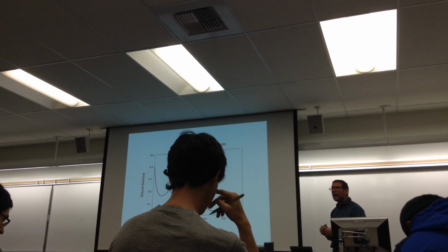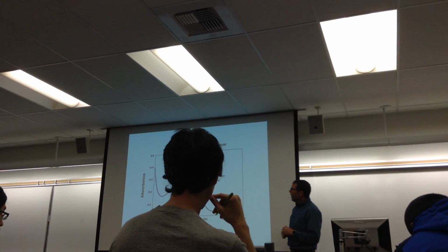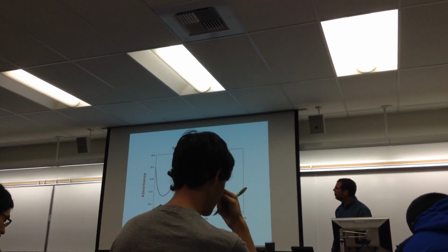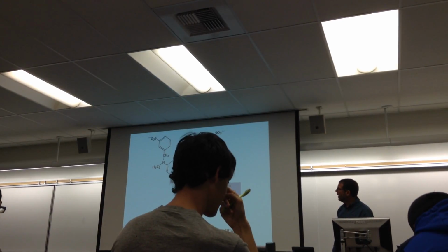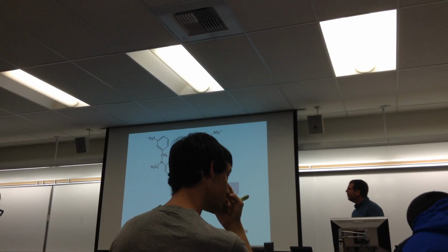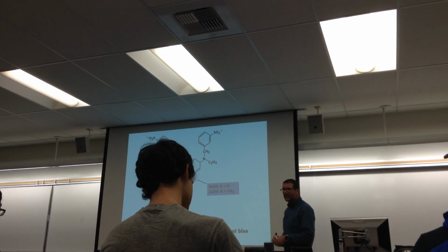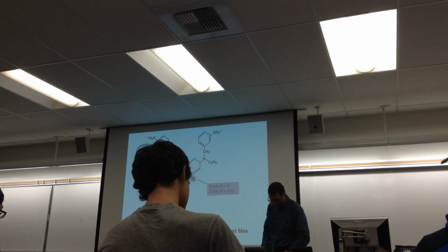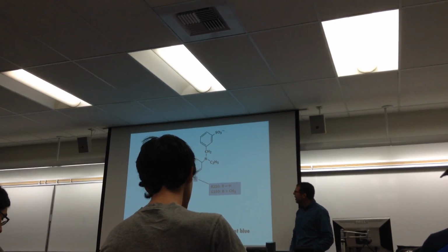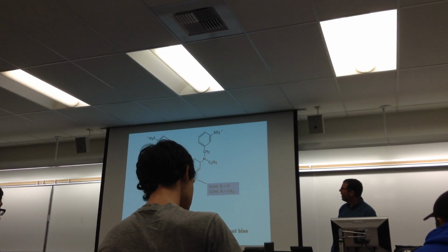All right, that's not the only technique. There's also, you can analyze by Coomassie brilliant blue binding. It's also known as the Bradford reagent. And so this is the structure, and what it basically does is it binds basic, or basic amino acid residues. And what it does, it causes a shift in absorbance at 595 nanometers.